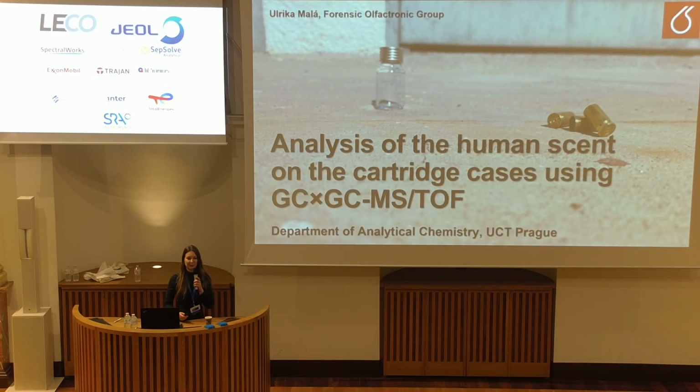So, ladies and gentlemen, I would like to present you the topic of analysis of the human scent on the cartridge cases using GC/GC-MS TOF.